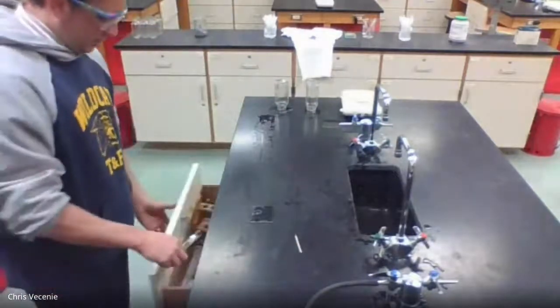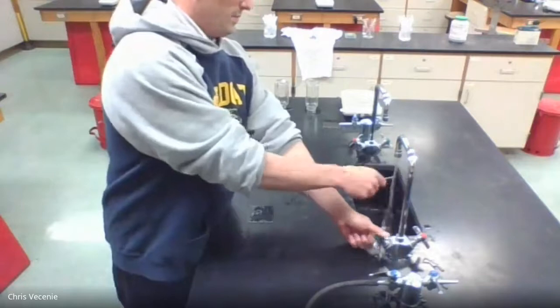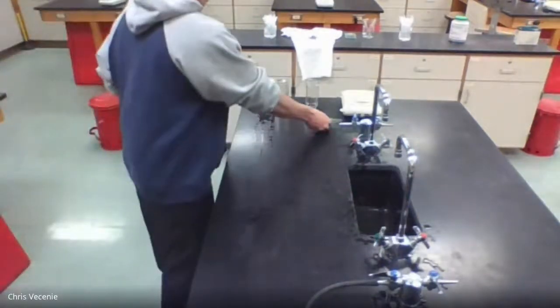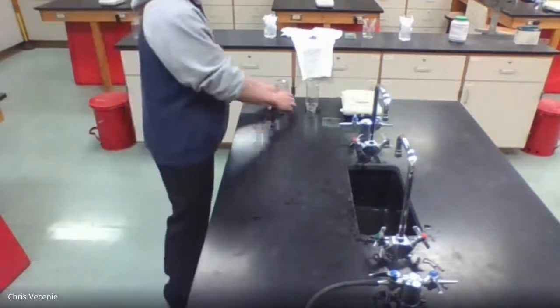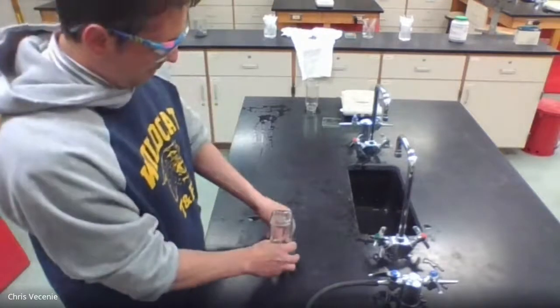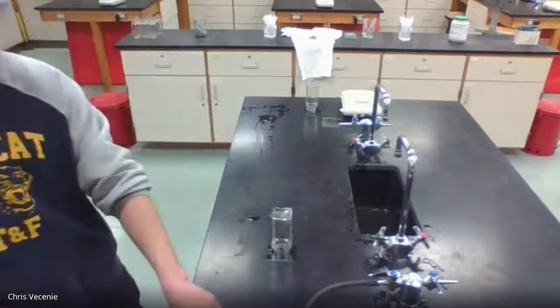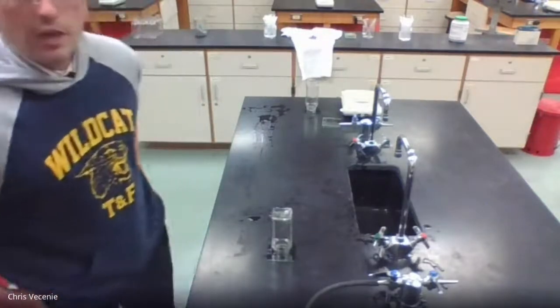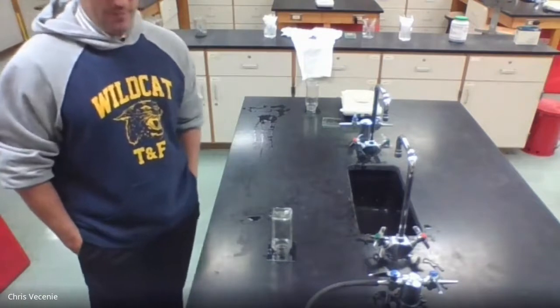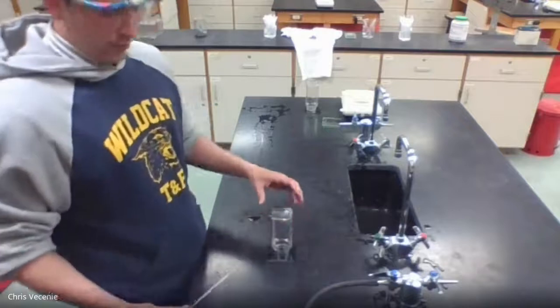All right. So I'm going to put my test tube away. Wet this splint. Put it off to the side. All right, and now we're getting ready for round two. Round two is going to be on this bottle. This bottle, we are testing for diffusion. I'm going to test the top, and then I'm going to test the bottom, to see if hydrogen is in both locations.